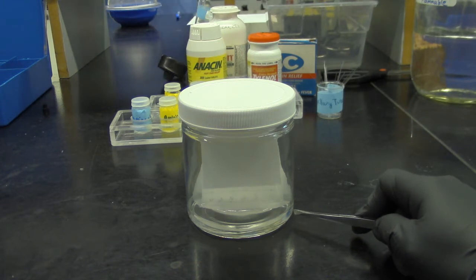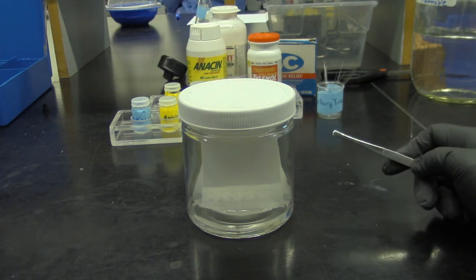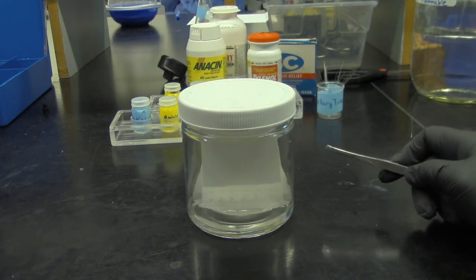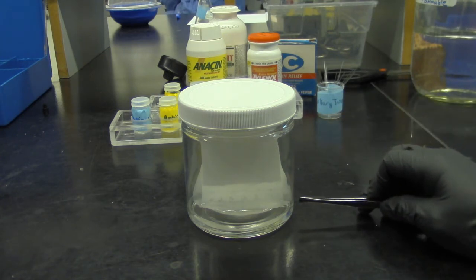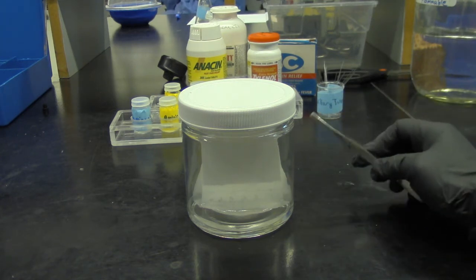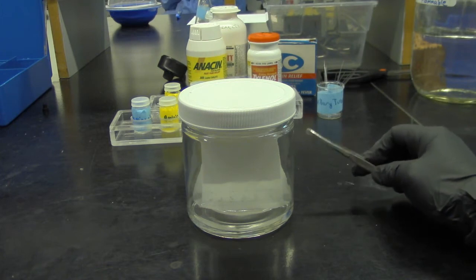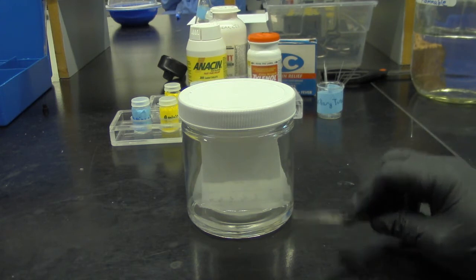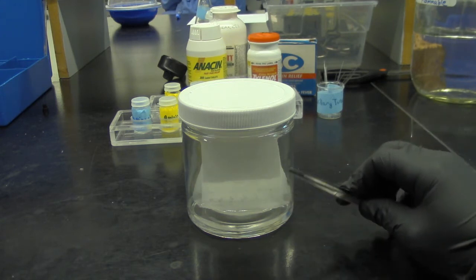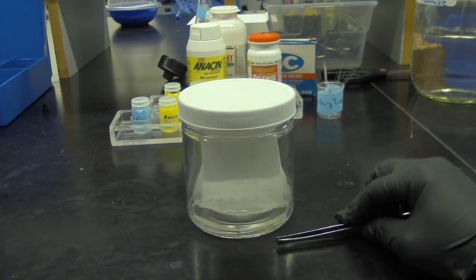And what is stationary phase in this case? Well, you can think about it, right? Okay, stationary phase is the one that's not moving. So what is this? What is that plate? Is that the TLC plate, silica on TLC plate, considered stationary phase? Well, I don't know, so you have to think about it. So I'm gonna let this TLC develop in the developing chamber, and we'll come back to this later, okay?